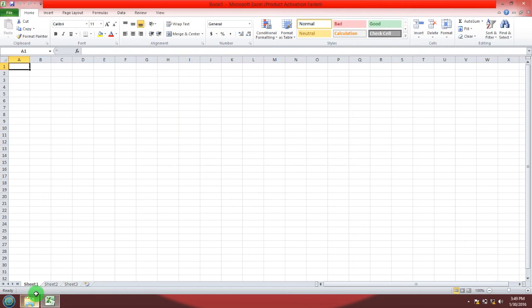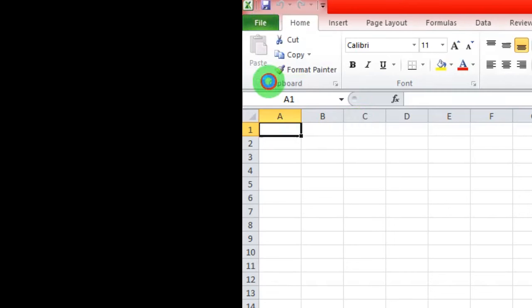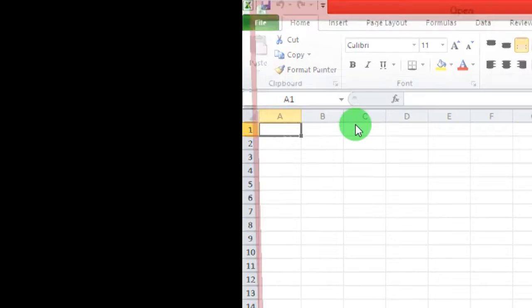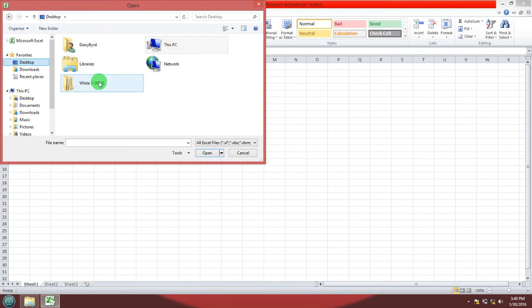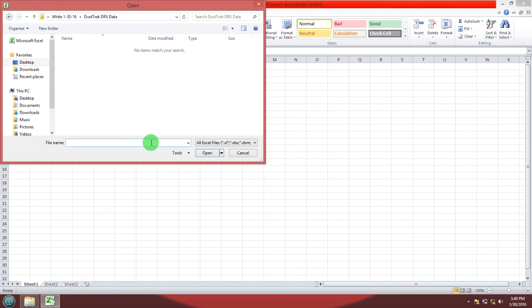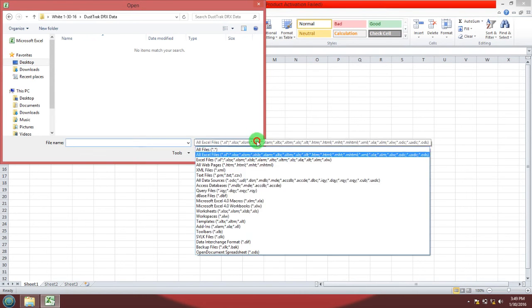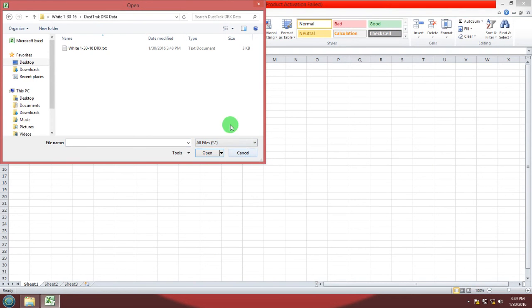Inside Excel you're going to want to go to file, open. Now you want to find your text file. Go to your folder on the desktop, DustTrack DRX data, and right off the bat it doesn't see a text file so you have to select all files. Now it'll see your text file. Go ahead and open that.